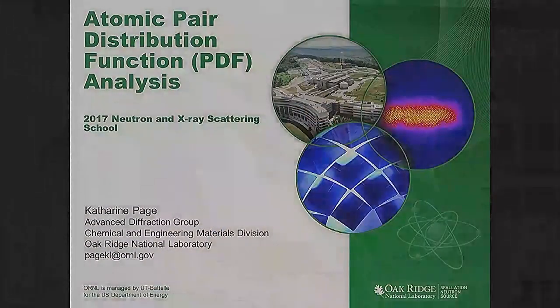Okay, so I'm going to talk to you today about the atomic pair distribution function technique. It's called the PDF technique.